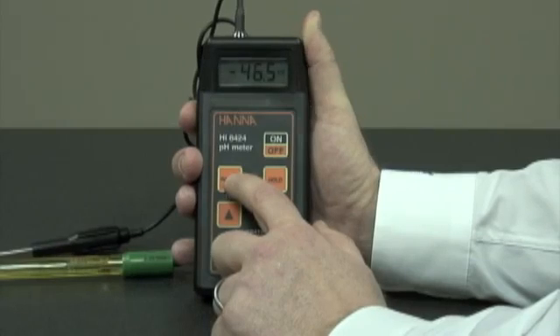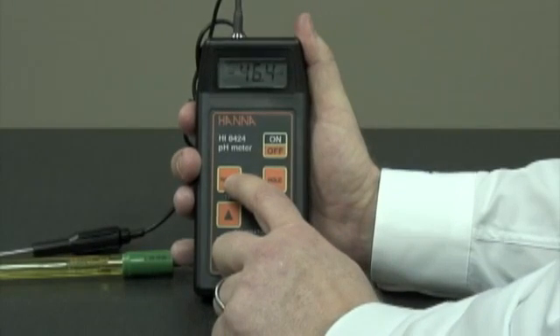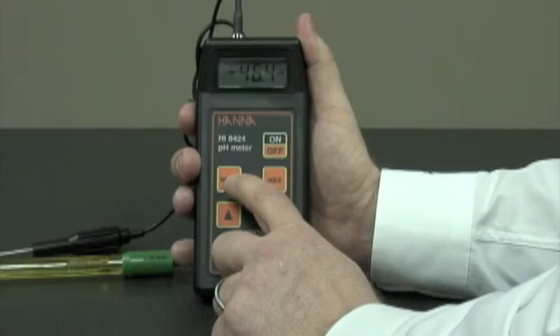In the millivolt range, we can see pH in millivolt, or we could use an ORP electrode.